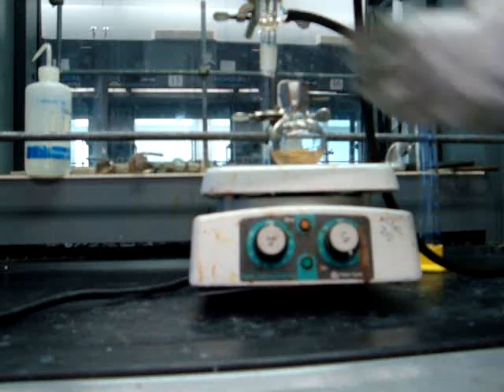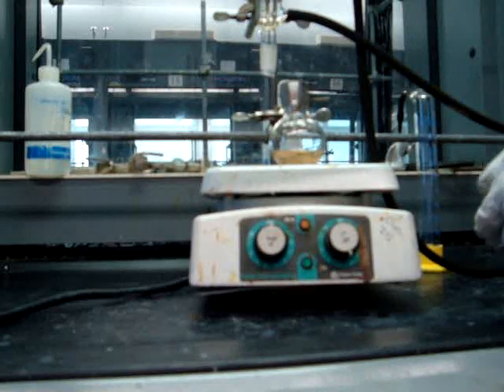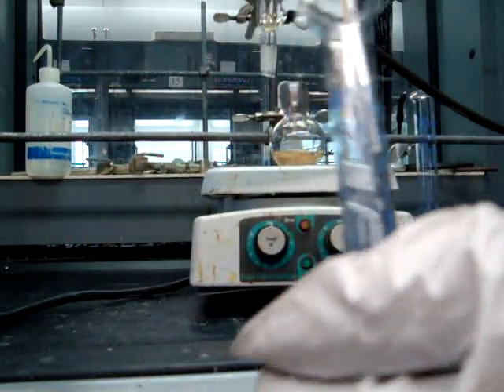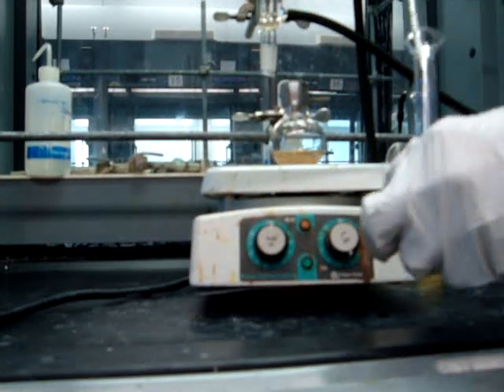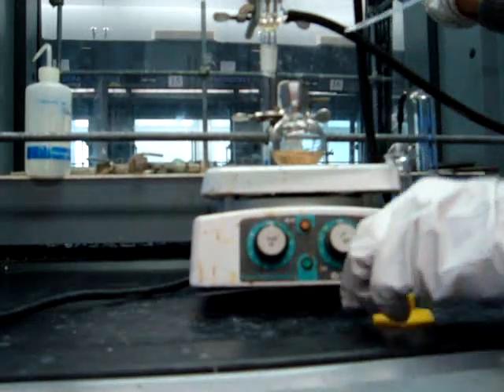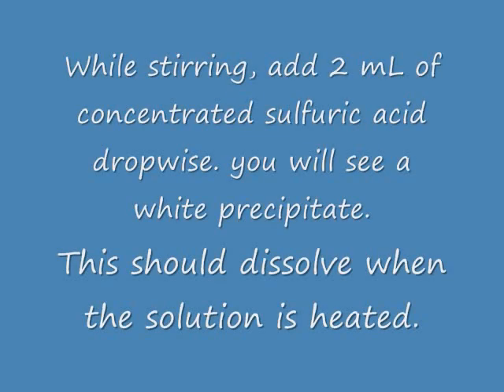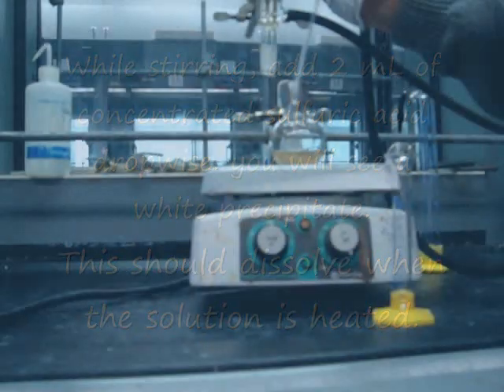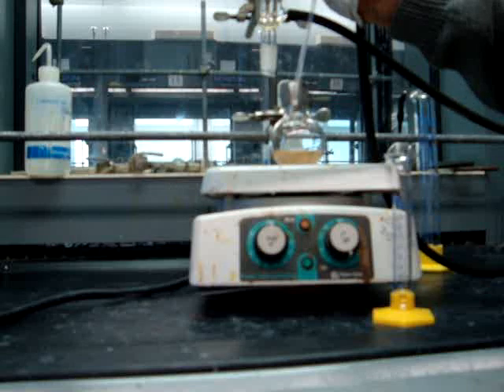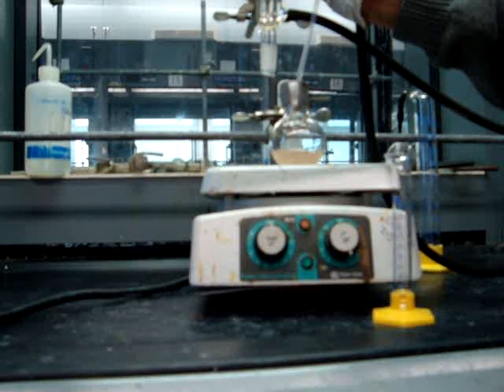Now you will be adding 2 milliliters of concentrated sulfuric acid dropwise. You want to make sure that you are very careful with the sulfuric acid by wearing gloves, and make sure that you are pipetting away from yourself at all times. You will see a precipitate that forms upon the addition of sulfuric acid, and this should dissolve when the solution is heated.